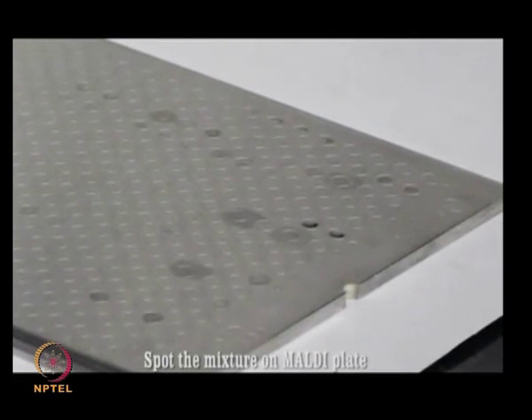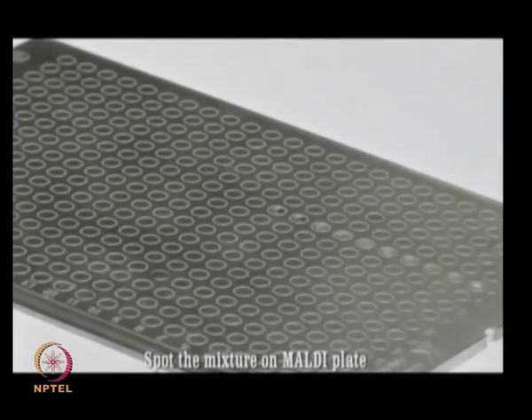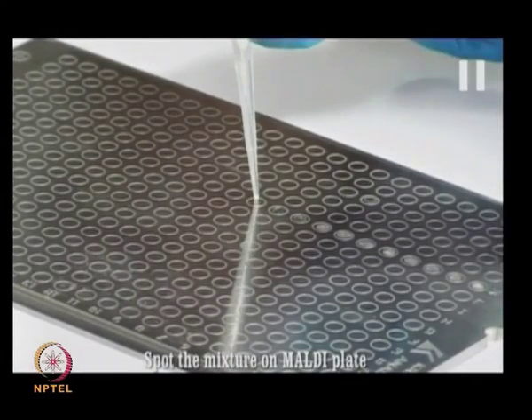So, in this video, by depicting the matrix preparation as well as instrumentation, we will try to give you an overview of the MALDI-TOF instrumentation. So, spot the mixture on the MALDI plate.